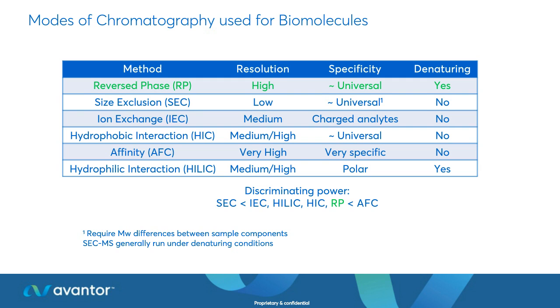What I'm going to talk about mostly today is reverse phase, because we're adapting those modes that we know well for small molecules to our large molecules. And really, we don't use affinity or hydrophobic interaction with small molecules at all. They tend to be used mostly with proteins. So we're going to talk a lot about reverse phase and a bit about HILIC for more polar components and some of those post-translational modifications, specifically glycosylation.